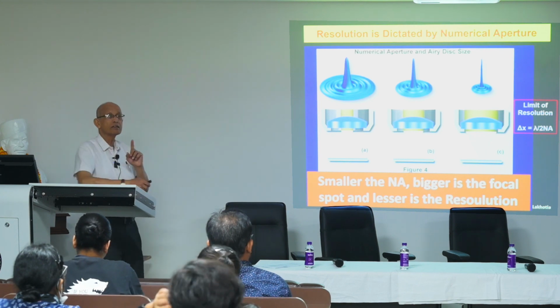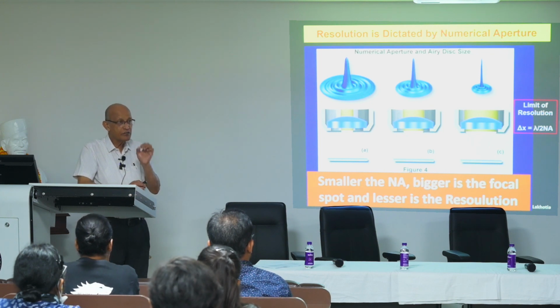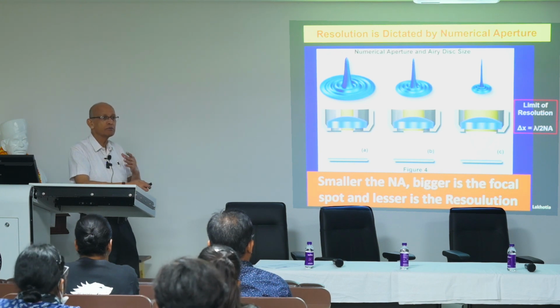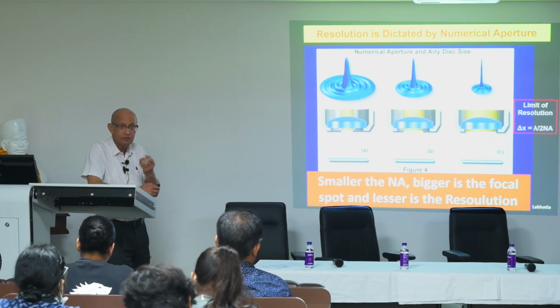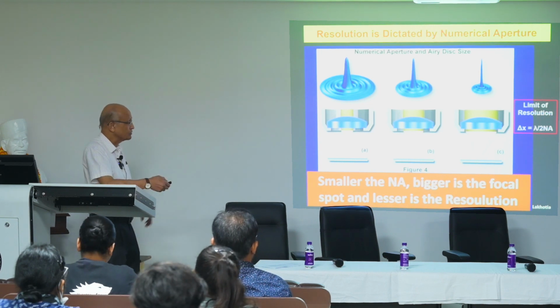When we say it has a better limit of resolution, it means it can differentiate objects separated by a smaller distance. So there's a reciprocal relationship between limit of resolution and the distance. The smaller the distance, the better the resolution. And that's what we calculate by this.